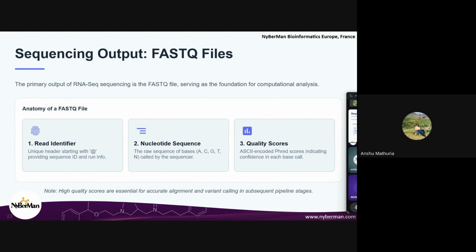That is what it is saying when it has a low probability and a low score. That is why we generally try to remove them and modify all of that. That is another quality assessment test that we will be doing. That is different. So from FASTQ files, the major thing that we have to understand here is a quality score.